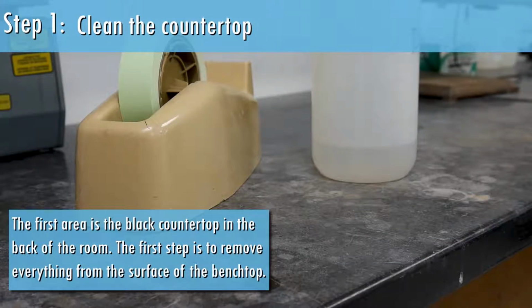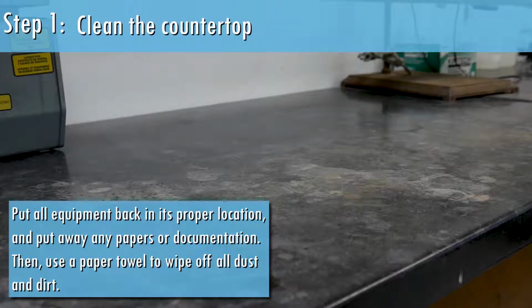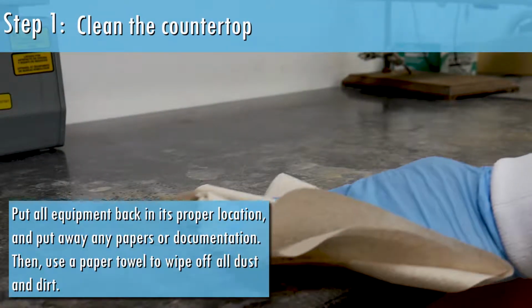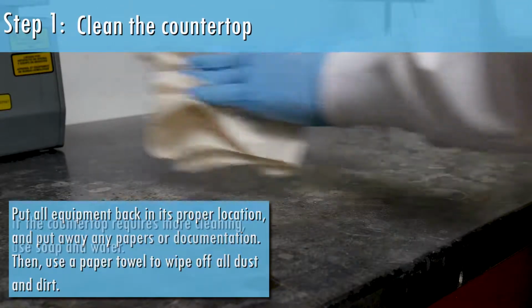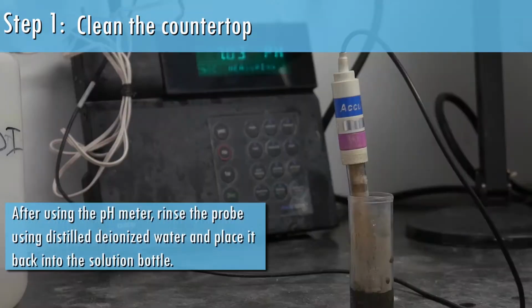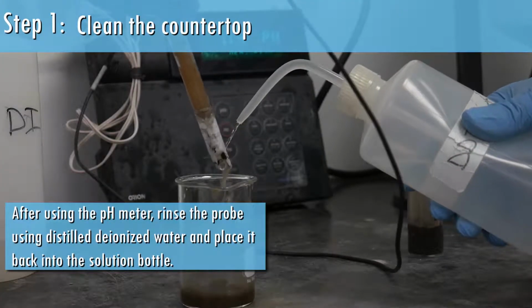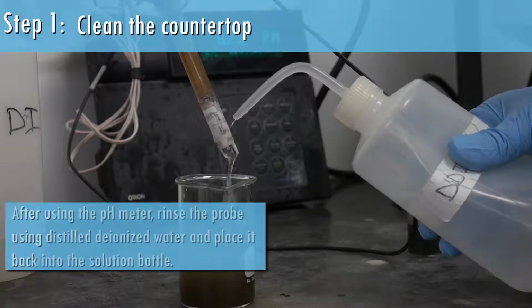The first area is the black countertop in the back of the room. The first step is to remove everything from the surface of the benchtop. Put all equipment back in its proper location and put away any papers or documentation. Then, use a paper towel to wipe off all dust and dirt. If the countertop requires more cleaning, use soap and water. After using the pH meter, rinse the probe using distilled deionized water and place it back into the solution bottle.